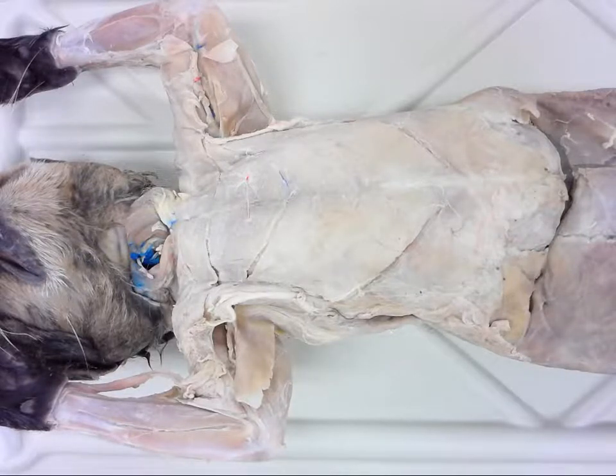The pictures I've given you are going to be a good resource. However, some find them difficult. This will hopefully supplement that a little bit to give you an idea of what things would look like on an actual specimen. It is still two-dimensional — you won't be able to manipulate or move things around — and I'll try and give the best views I can possibly give of specific structures as I'm going through it.